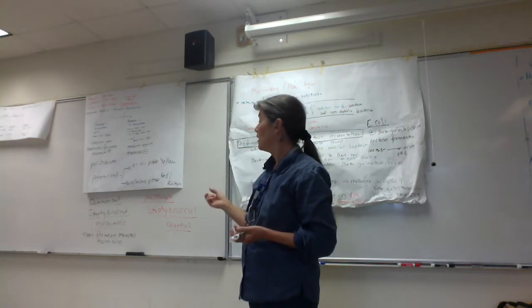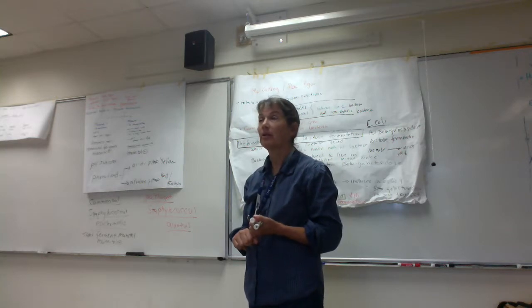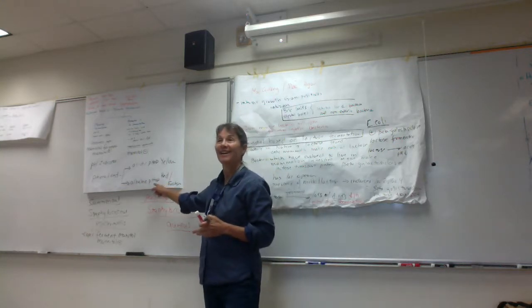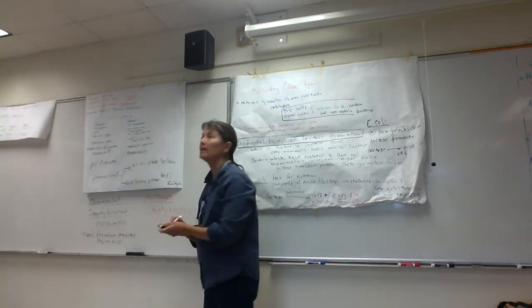So if we're growing Staph epi on our mannitol salt agar plates, it can't ferment the mannitol. It attacks amino acids, releases ammonia. The pH goes up. And at alkaline pH, what color is phenol red? Red, yeah. So here we have mannitol salt agar, and we see we have good growth of our salt-tolerant Staphylococcus. So which species do you think this is? Staphylococcus epidermidis, right? Okay. So in contrast, folks, Staphylococcus aureus can ferment mannitol.